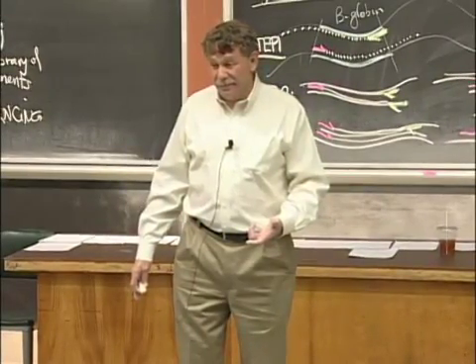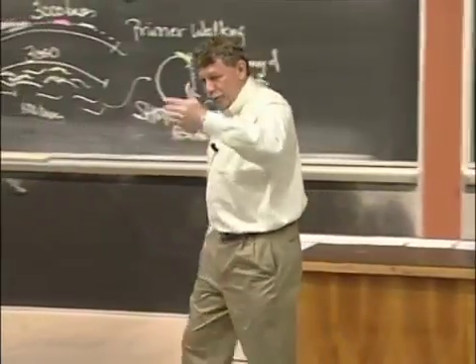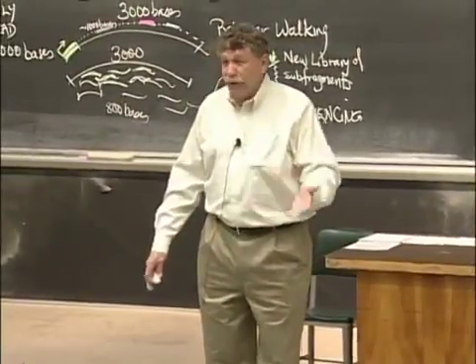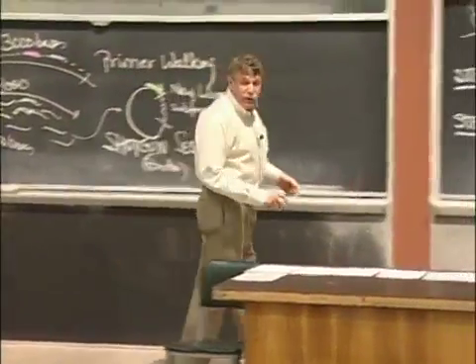Pretty cool. This is like a chain reaction. You do it once, you do it again, you do it again, you do it again. You just throw in polymerase, and you run a chain reaction. This, therefore, is called the polymerase chain reaction.